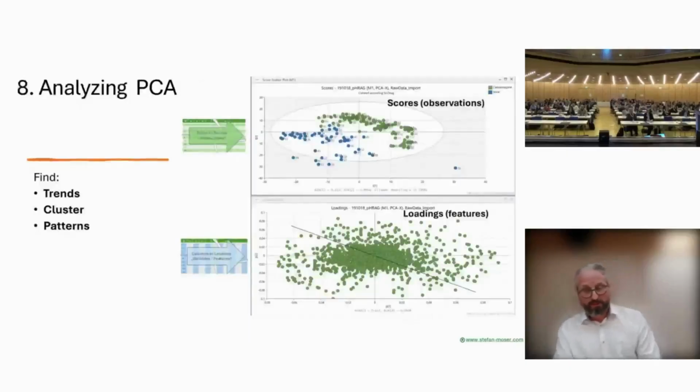Now, to the multivariate part. Principal component analysis, PCA, gives us an overview. Are the samples reproducible? Do we see clusters, patterns, or trends? It's just a starter for the analysis. Later on, OPLS-DA modeling then goes one step deeper, separating groups, for example, controlled versus treated samples.